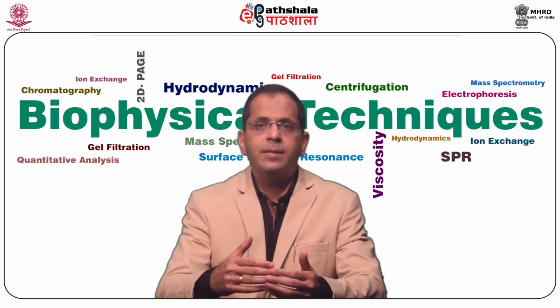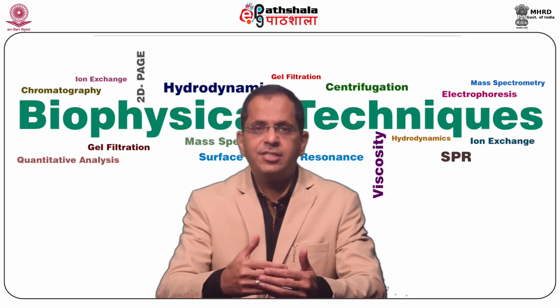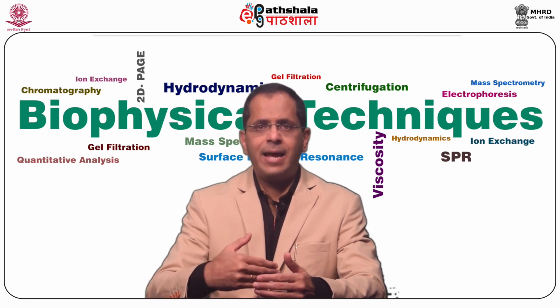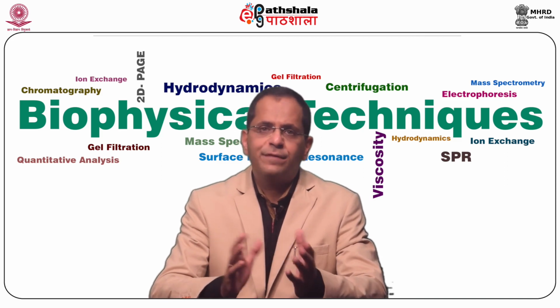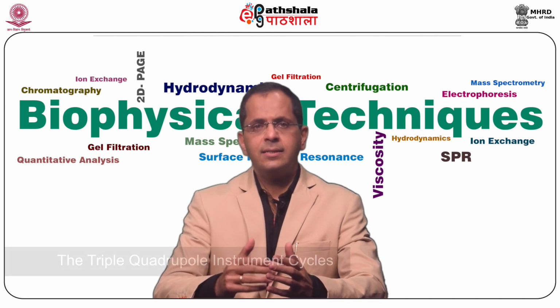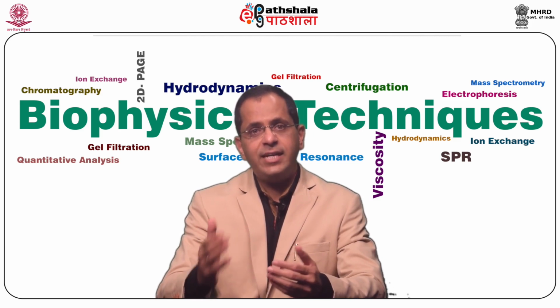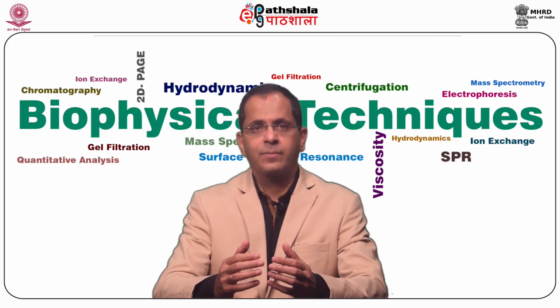Validation proteomics using multiple reaction monitoring, or what we usually call the MRM. MRM, or the multiple single reaction monitoring transitions, can be measured within the same experiment on the chromatographic time scale by rapidly toggling between the different precursor and fragment pairs. Typically, the triple quadrupole instrument cycles through a series of transitions and records the signal of each transition as a function of the elution time.